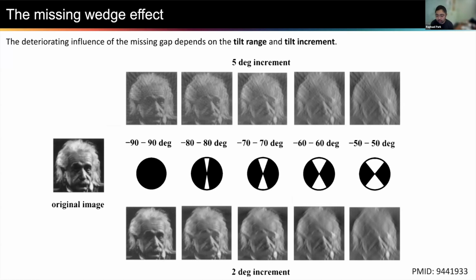But all these things have to be designed realistically, because if we set our increment too small, we have to take a lot more images on the same sample, and you'll accumulate too much radiation damage, so your sample will end up burning. So you'll have to find a very fine balance between what gives you a reasonable image at a reasonable total dose.